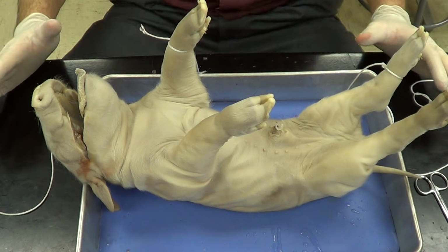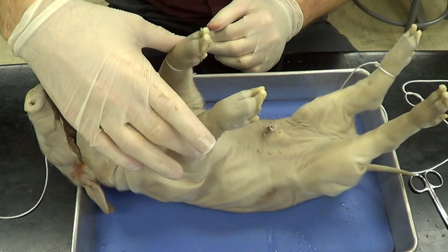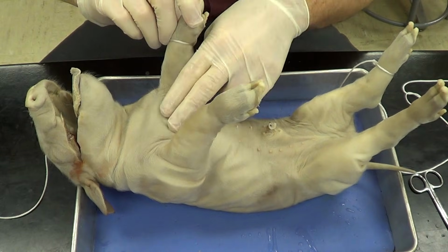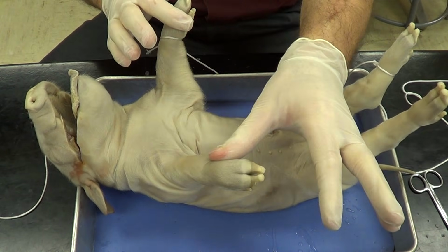Today we're going to be dissecting the fetal pig. But before we begin, we have to prepare the pig. The reason is, if you look at the legs, they have a tendency to cross over the body, over the chest and over the abdomen. And we need access to those areas. So what we want to do is just tie the limbs out of the way.